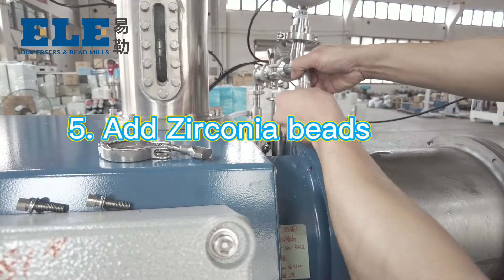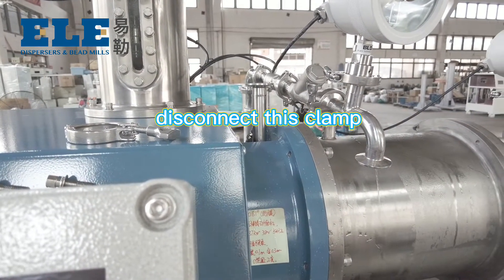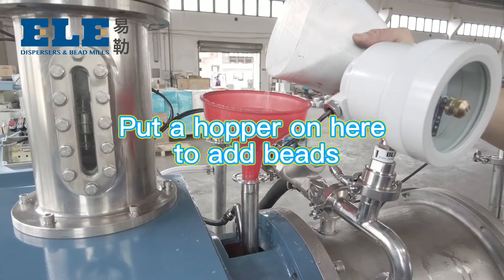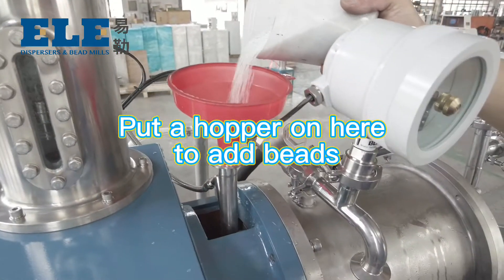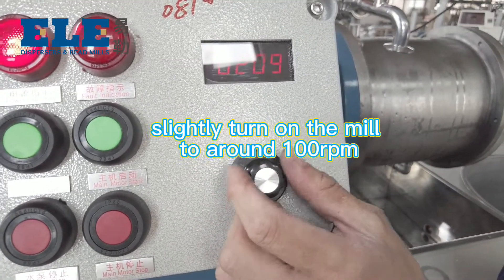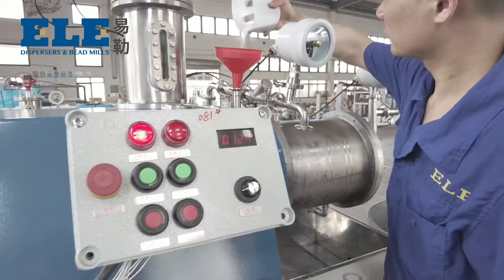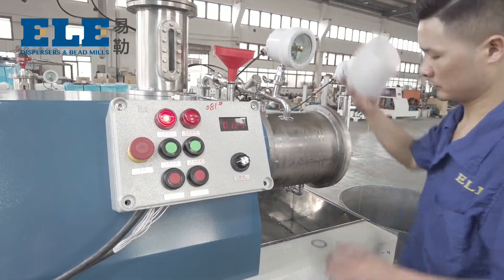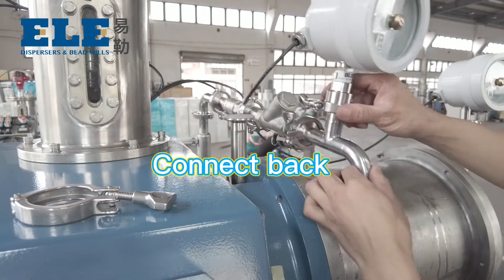Five, add zirconia beads. Disconnect this clamp and put a hopper on here to add beads. Slide the dial on the mill to around 100 RPM and make sure the beads go inside the chamber smoothly. After finishing, connect back.